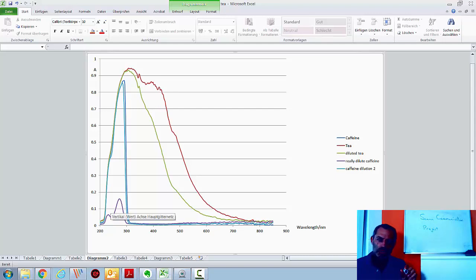So what we can also see is that there's still difficulty because absorption of 0.9 means 90% of the light is absorbed. It's already distorting our spectrum. That is not very good for spectroscopy and it was because I used our sort of C version of spectrometer. I used it because we've got two of those so it will be easier to use. But it's obviously not going to be very effective if our concentration goes up. And because we're extracting the caffeine we may have trouble with the concentration passing its limits. This is a dilution of a factor of two and nothing happens. So we need the shape to look like this otherwise we can't measure it at all.